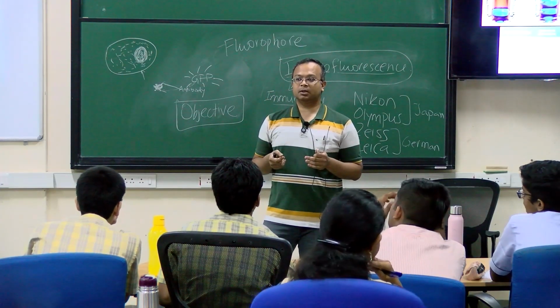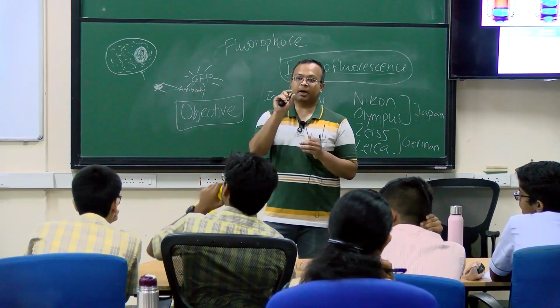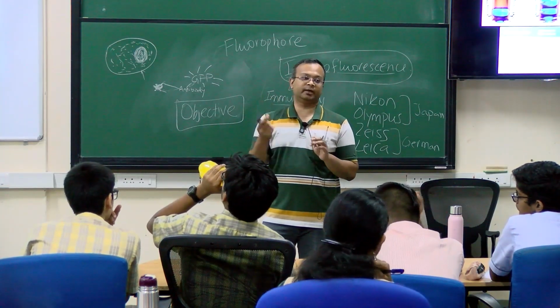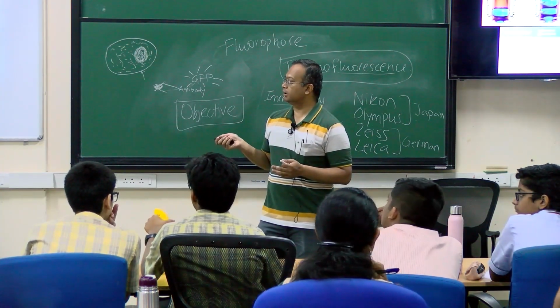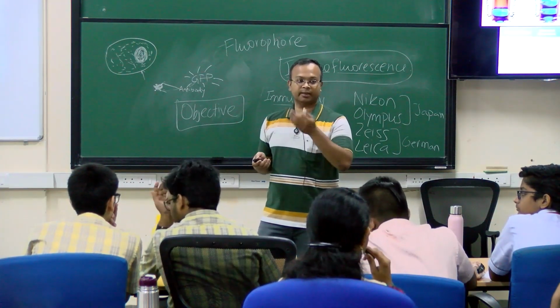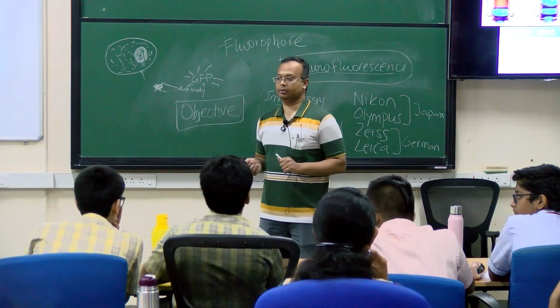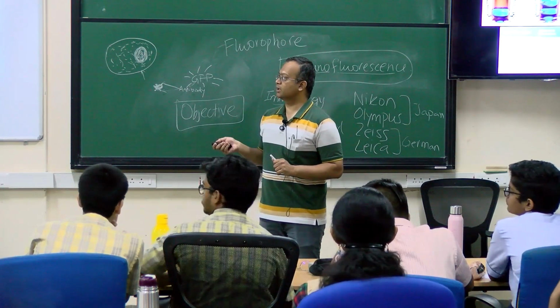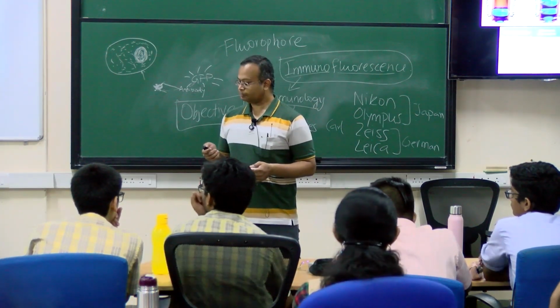That is because of spherical aberration, because different parts of the lens are bending light to different extents. To compensate for that, again there are different lenses. Depending upon how much correction I want, I can buy objectives of that particular scale. Each of them will be more and more expensive, but they will be better in terms of the correction.